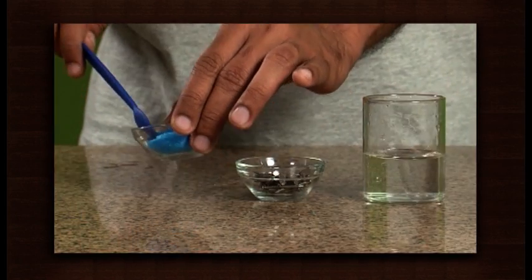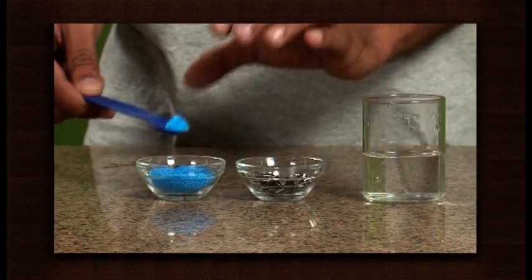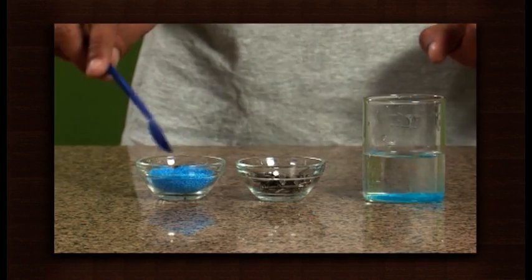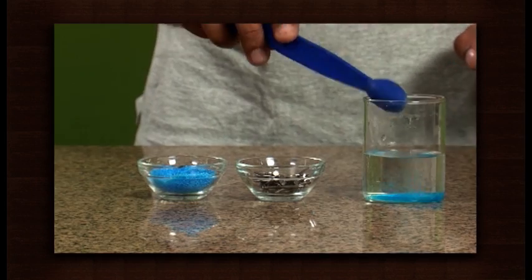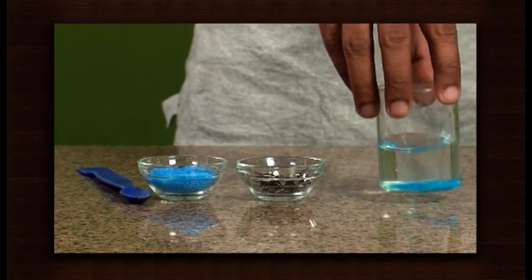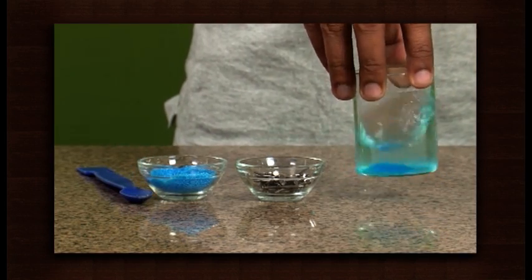Dissolve two spoons of copper sulphate in some water. Swirl it to obtain a clear blue solution.